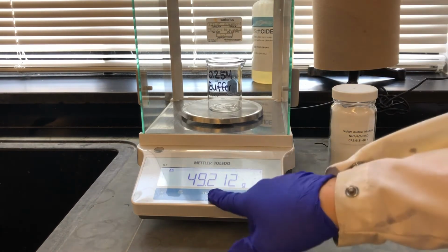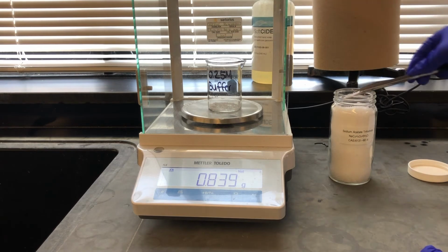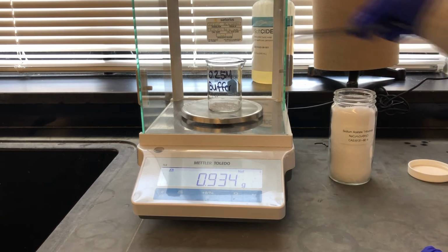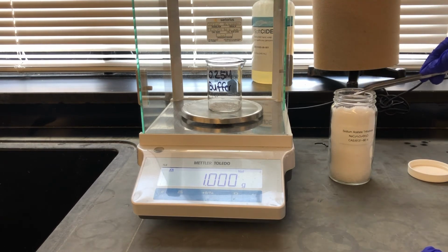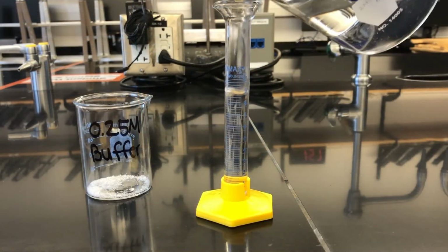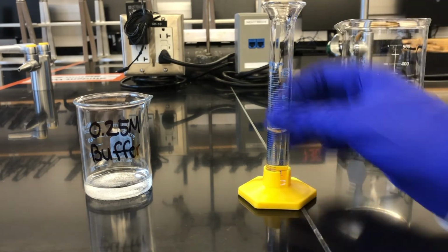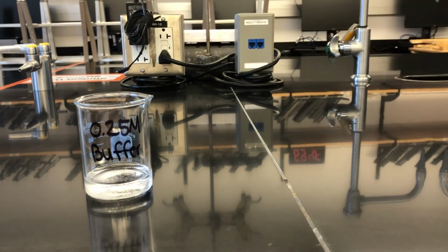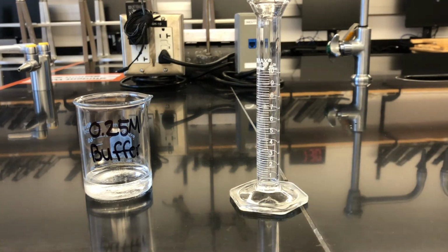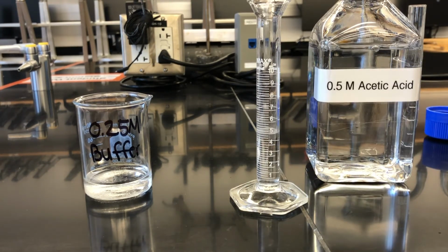To start Part C, we first prepare 30 milliliters of a buffered 0.25 molar acetic acid solution. To a clean 100 milliliter beaker, we measure as close to 1.021 grams of solid sodium acetate trihydrate. Next, using a graduated cylinder, we measure 15 milliliters of deionized water and add that to the beaker. Finally, we measure 15 milliliters of 0.5 molar acetic acid and add that to the beaker before thoroughly mixing with a glass stir rod.